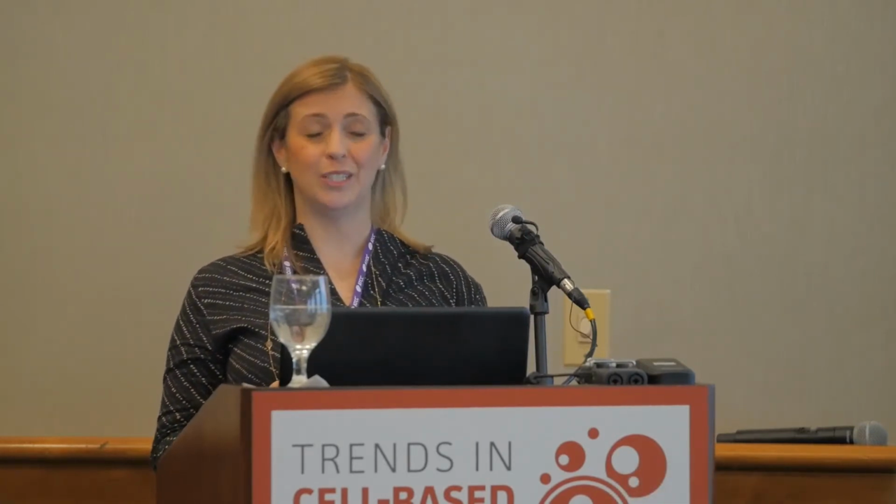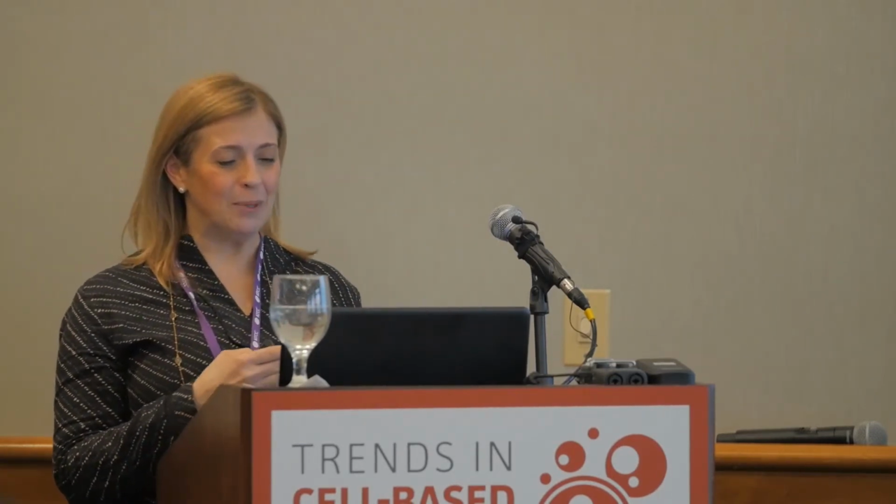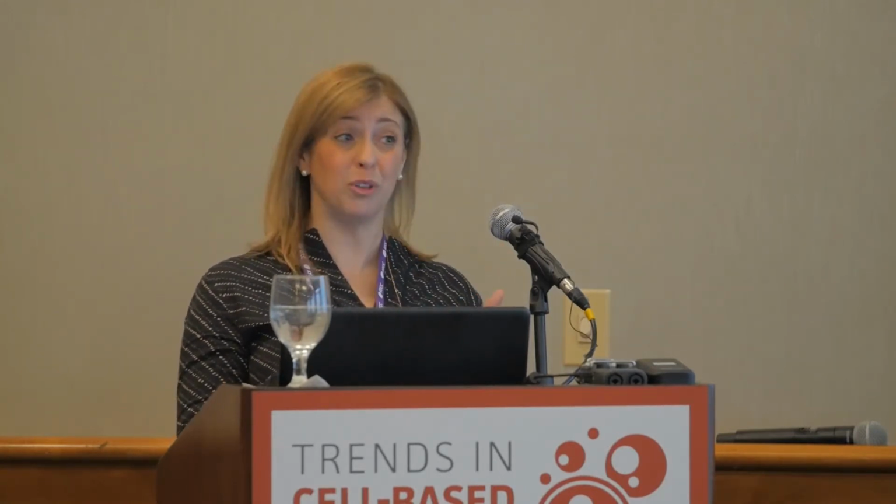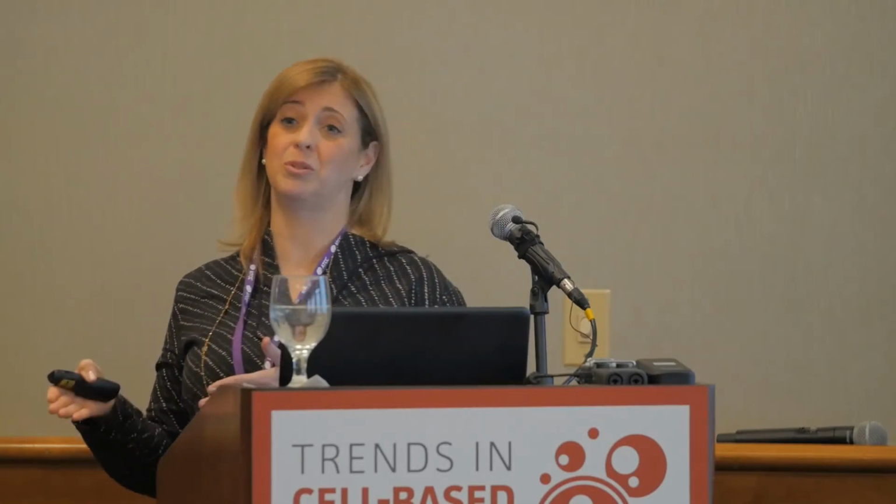And likely maybe a step motor was the first thought that came to mind. But you got to understand the business drivers for this program were huge. So I met more senior people, and my boss had just left the company. My manager had just left the company. He was brilliant and so fun to work with. And he leaves me right before this investigation was starting. So I'm put in these rooms, and these people are saying, no, Marla. I'm like, no, yes. So I had to go and tell senior management in QC that there might be something wrong with both of their plate readers that is used to release commercial product.